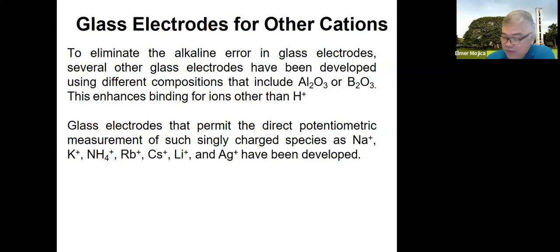It responds fast and functions well in physiological systems. Mostly, we could say they're selective for monovalent cations only because polyvalent ions cannot penetrate the surface of the membrane.